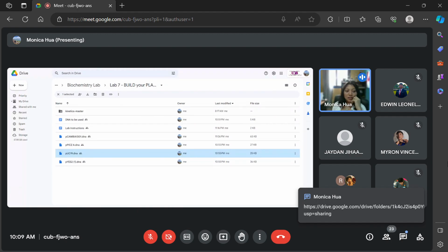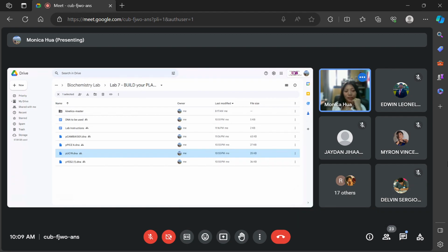And what I want you guys to do is download the files named pCAMBIA, pPICZ, pUC19, and pYES2. Download those files. Don't worry, we have 2 hours to get this.